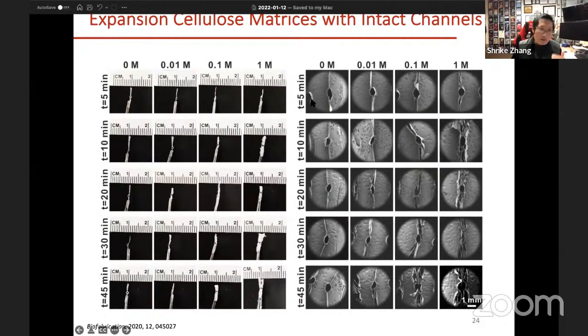So without any bubbling, our original device is only about 200 micrometers in thickness. But if you bubble them for long enough and with a high concentration of the sodium borohydride, you can eventually form a device that's expanded to a pretty thick thickness, all the way to about a few millimeters, right? And also containing all the interconnected micropores throughout the entire thickness of the device.